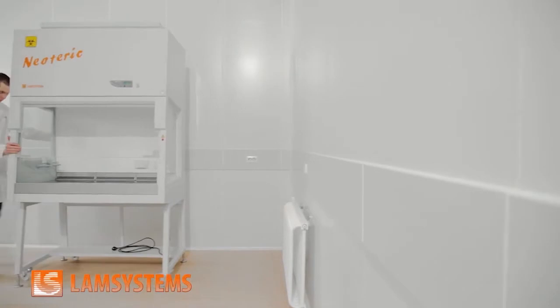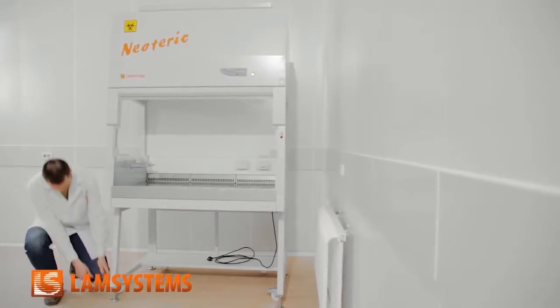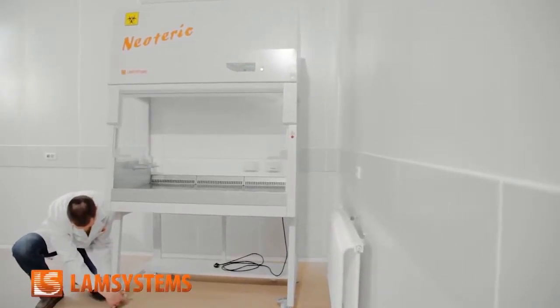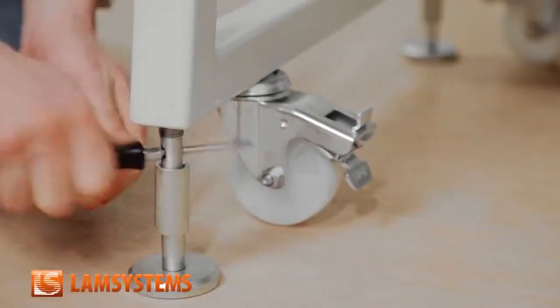Move the cabinet to the place of its permanent installation using the wheel supports, and then fix the cabinet using the screw supports. Notice that after you have fixed the cabinet with the screw supports, the wheels should not touch the floor.